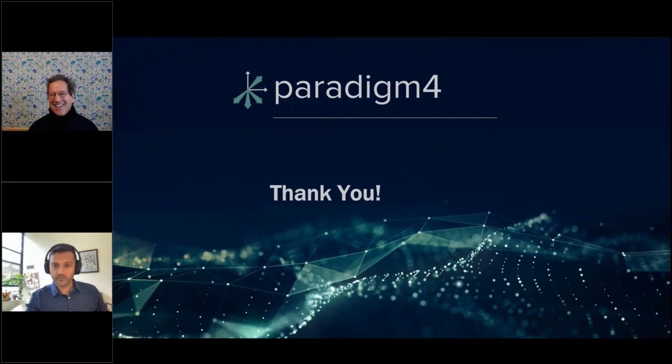Yeah, so thanks, Srikant and Zach. So then maybe I'll ask a question of the speakers. So Zach and Srikant, in terms of the direction of travel of the Allotrope format and the offerings feeding into data science tools in general, maybe just take it a little more broadly. Any sort of insights for the Allotrope Foundation as we're proceeding forward along our journey to standardize data? What we could be thinking about to help the data science community in general?